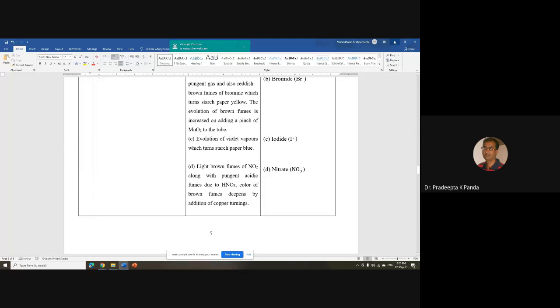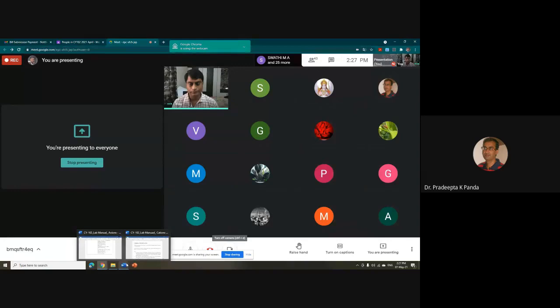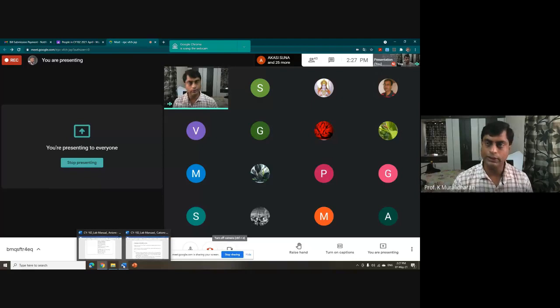you took some mixture of salt at the beginning, you told, I think, right? Yes. So you should tell them the tests accordingly, right? Which one is going to respond? I'll tell that one, because for the previous tests I am telling that they are only indications, right?